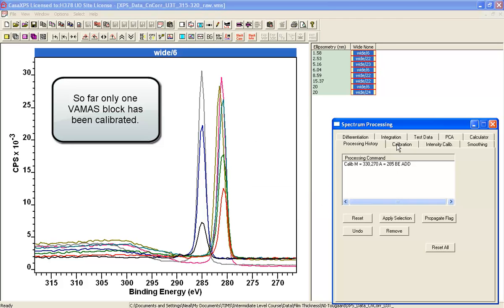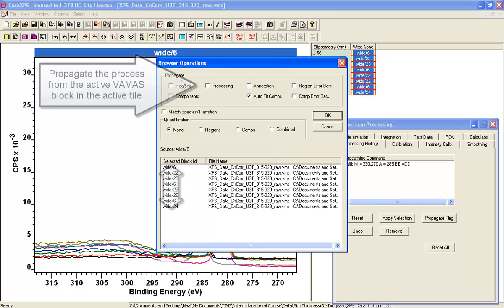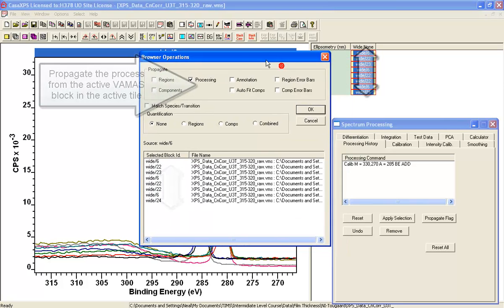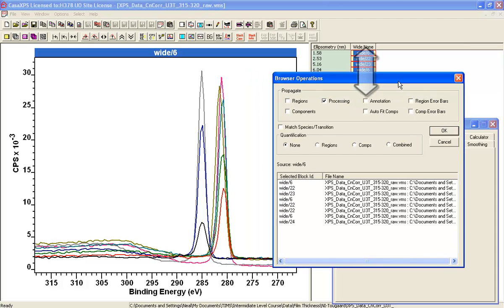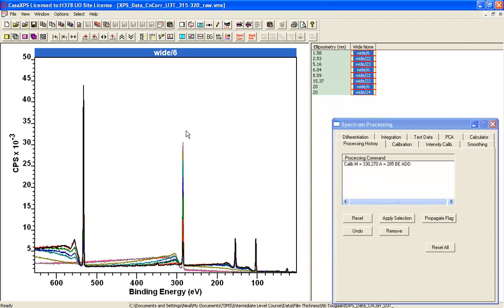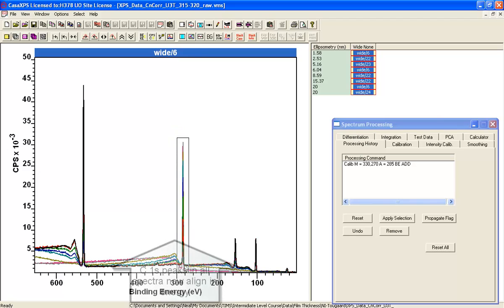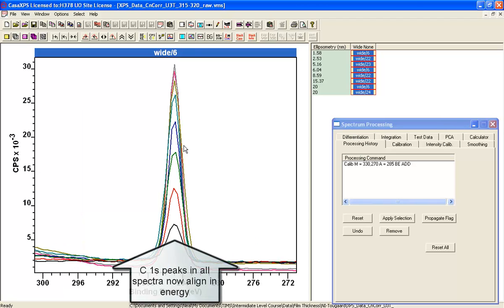Now having applied it to the first one, I can now propagate from the first one to the others. And when I do this, we will obtain an approximation to the calibration for all of these spectra.